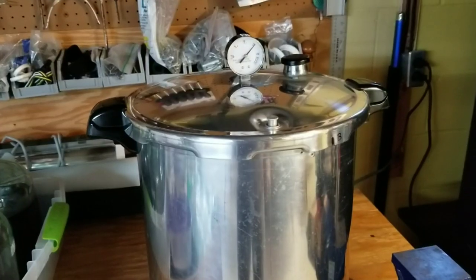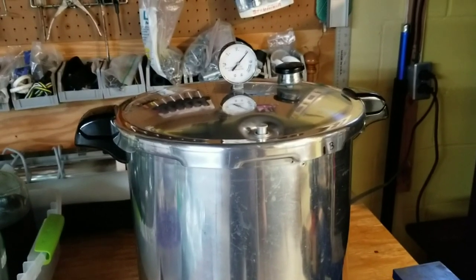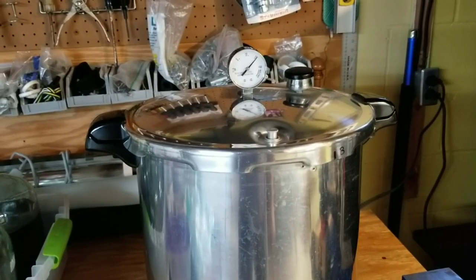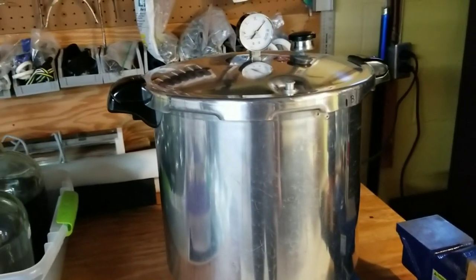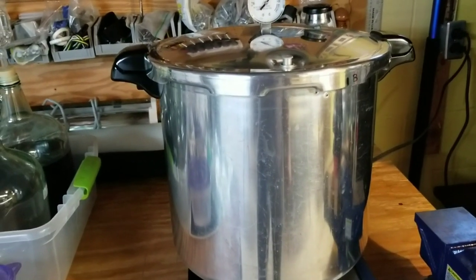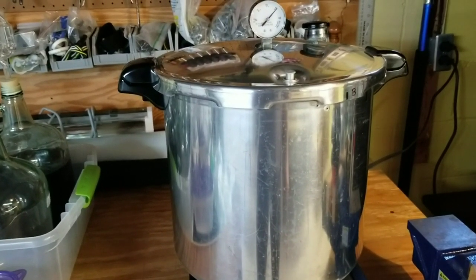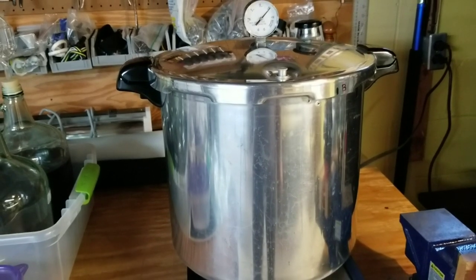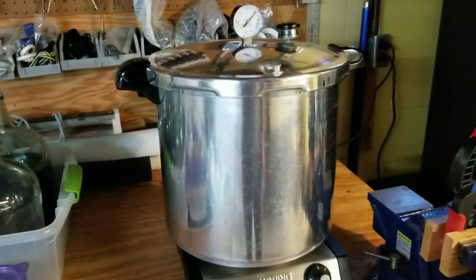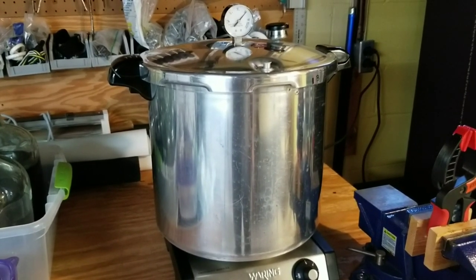With pint jars, 300 milliliters of nutrient broth, and the rings snugged right down, I've never had any issues. Once we hit 15 PSI and we're rocking, I'll set the timer for 25 minutes. Once the timer goes off I'll shut her down and let her cool. It takes quite a while for these LC jars to cool — we're getting them up to 252°F — and it's going to take several hours. Never squirt any living culture into something hot; let it cool to room temperature or you'll kill your culture.